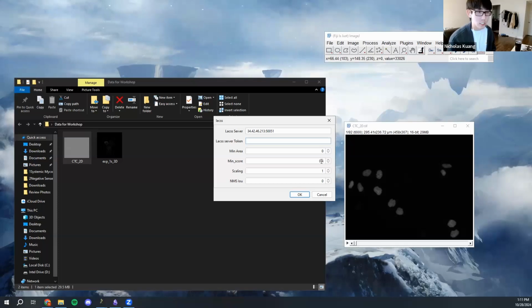So depending on how stringent or how lax you want your detection to be, you set it from 0 to 1, of course, with 1 being perfect, which is essentially impossible, and 0 being, of course, as loose as possible. But for today, we have default at 0.4.